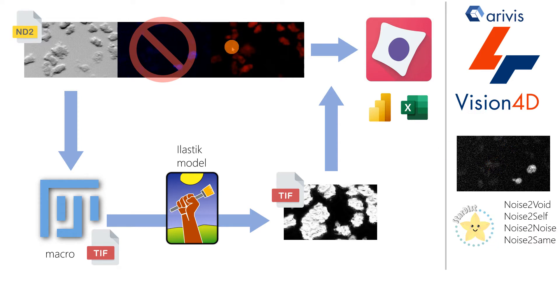StarDist does a wonderful job if you represent this DAPI channel in grayscale, which you should do because the eyes don't pick up on the blue—you can just about make out some of those faint signals. We're going to do another few tutorials on something like StarDist and some of these noise-to-noise machine learning models to remove some of that noise to help with that process as well.